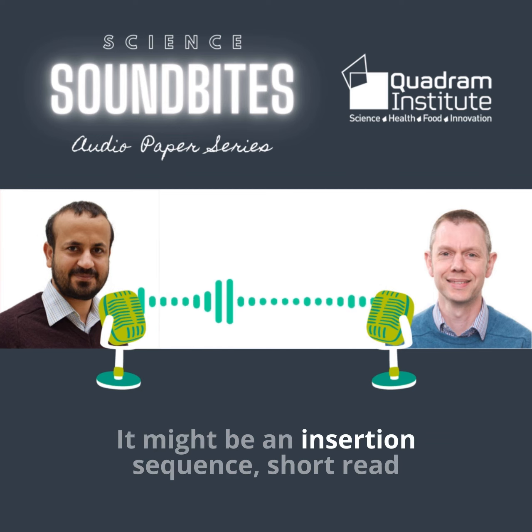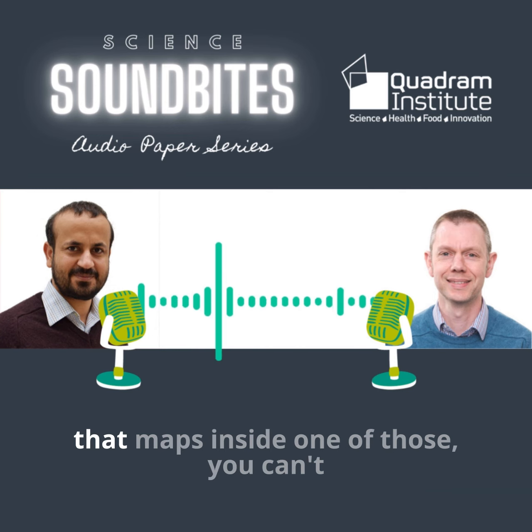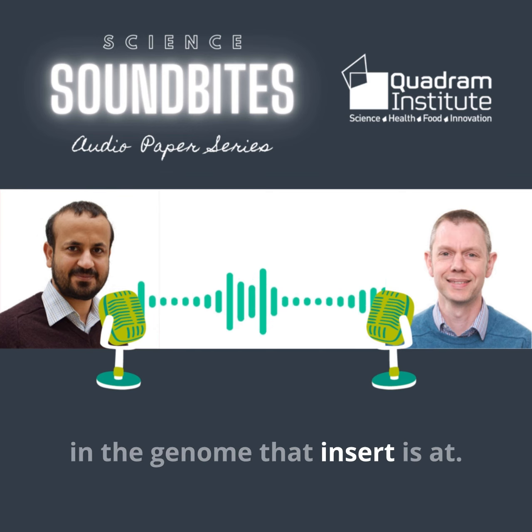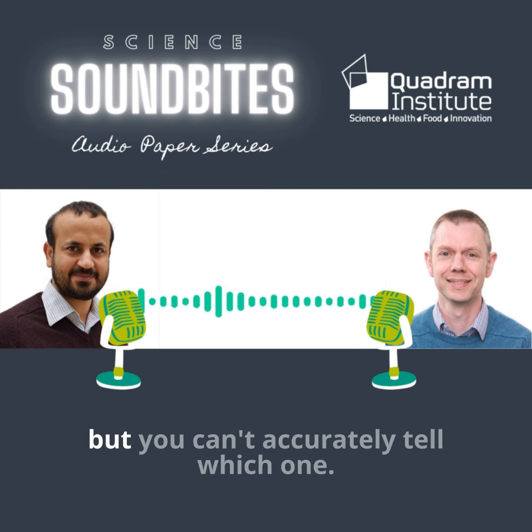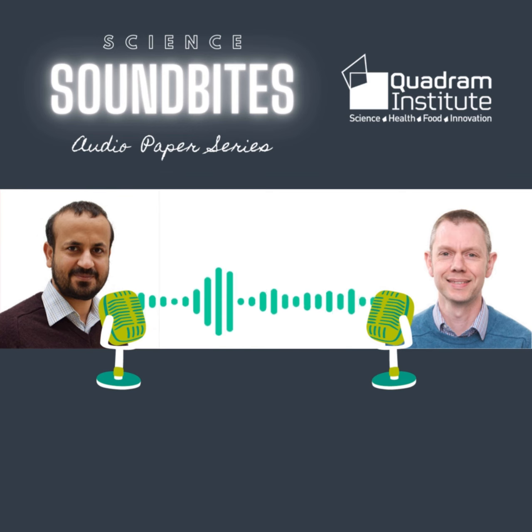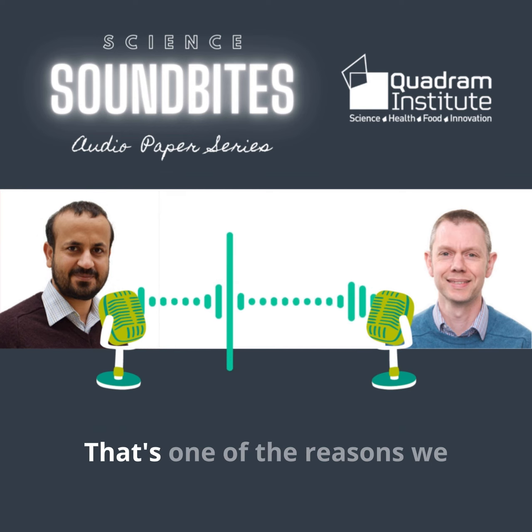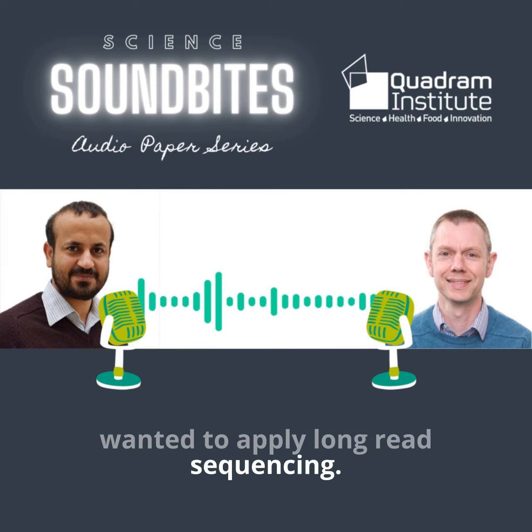Or it might be an insertion sequence. Now, a short read that maps inside one of those, you can't read out into the flanking genome, so you don't know which position in the genome that insert's at. So you know it's in one of these elements, but you can't accurately tell which one. And sometimes that might be biologically important, and we're missing that information at the moment with the short read method. That's one of the reasons we wanted to apply long read sequencing.